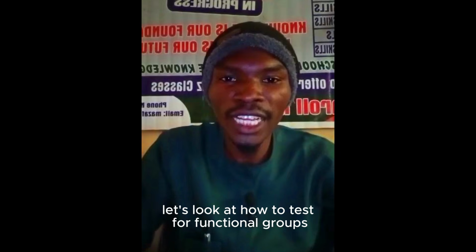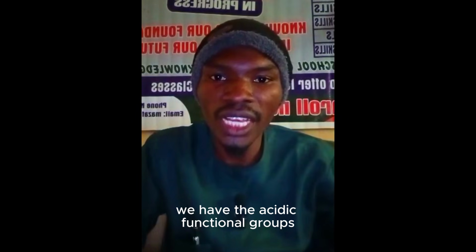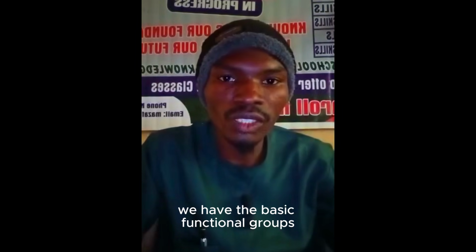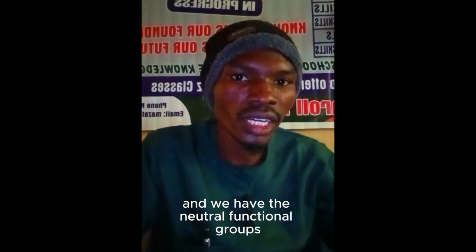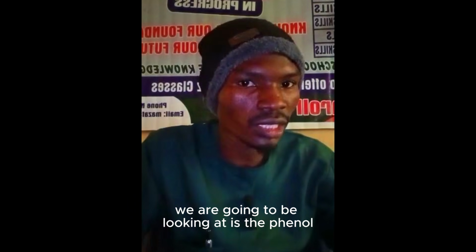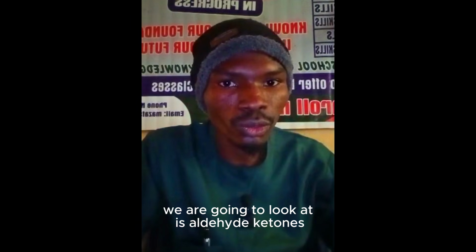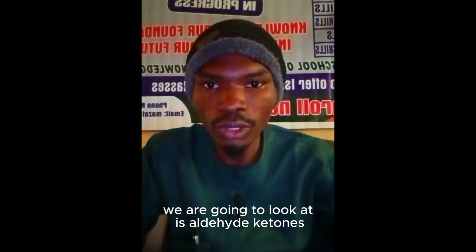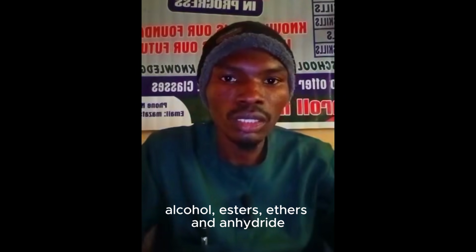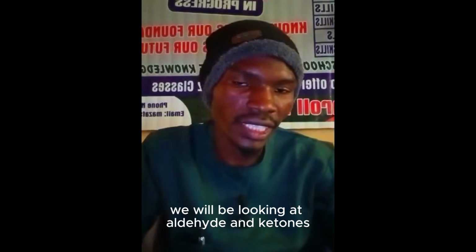Thank you. Now, let's look at how to test for functional groups. To test for functional groups, we have the acidic functional groups, the basic functional groups, and the neutral functional groups. The acidic functional groups we are going to be looking at are phenol and carboxylic acid. The basic functional group we are going to look at is amine, and the neutral functional groups are aldehydes, ketones, alcohols, esters, ethers, and anhydrides. But specifically, we will be looking at aldehydes and ketones.